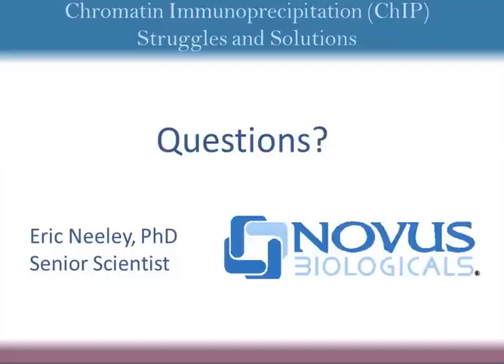Getting some questions just coming in, so I'll try and keep up. Okay, so we have one here from Amy. This is on the automation. She's asking, how long does a standard ChIP protocol take, and does the precipitator machine make it faster? So that's a good question too.